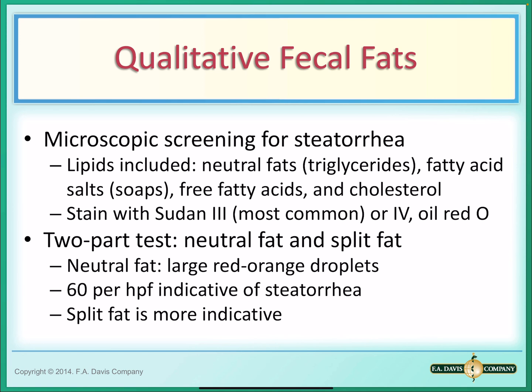However, the split fat stain represents the total fat content, and that can provide a better indication of steatorrhea. Breakdown of neutral fats by bacterial lipase and spontaneous hydrolysis of neutral fats may lower the neutral fat content, which precludes comparison of the two slide tests to determine whether maldigestion or malabsorption is causing the steatorrhea. So the split fat test is definitely more indicative here.